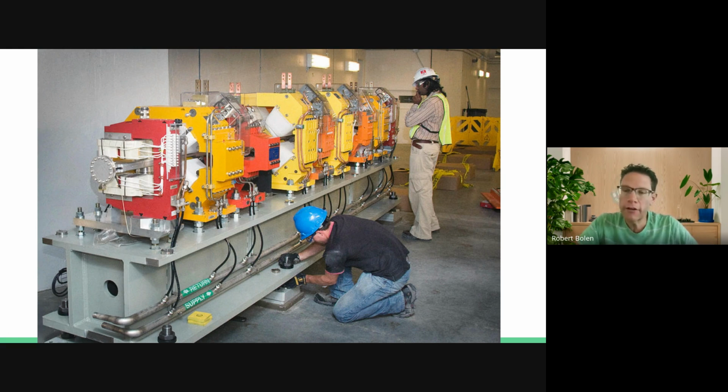And you guys remember when we had that earthquake earlier in the year? The whole light source shut down because they detected a change in the positioning of the beam because of the vibration from the earthquake. And so they had to shut down for a few hours to make sure that everything was all situated. And it automatically did that too. So it automatically detects if there's a change in the trajectory of the beam.